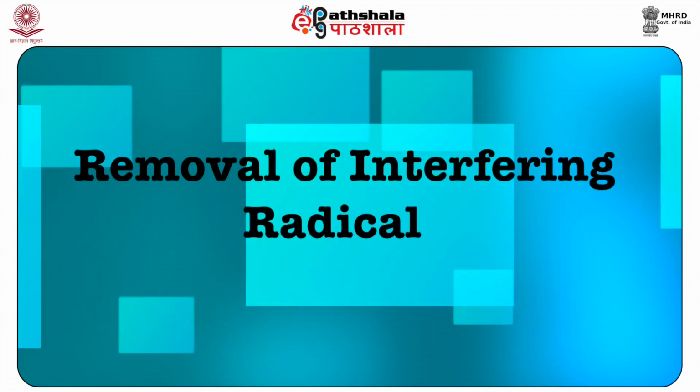Removal of interfering radicals. In the estimation of calcium or barium ions by the oxalate or sulfate method, phosphate ion is found to interfere.